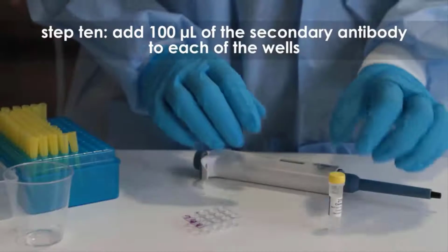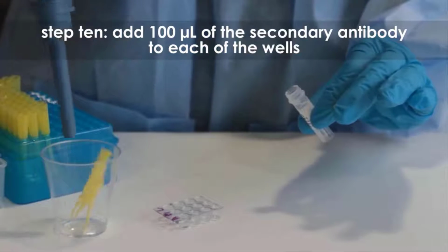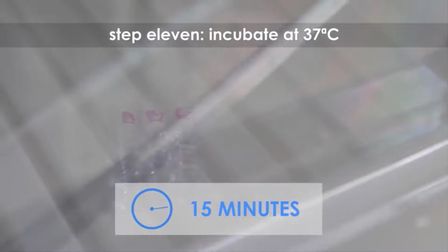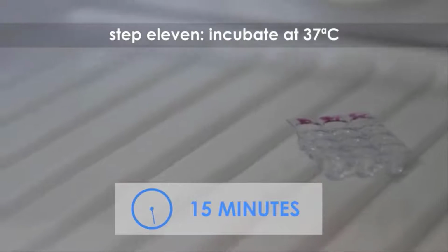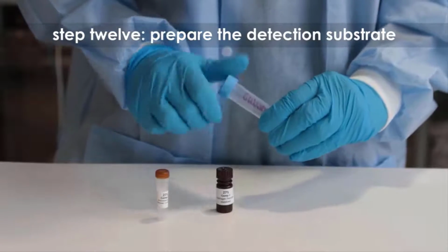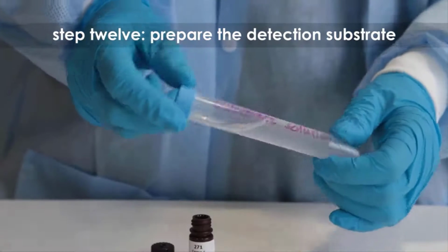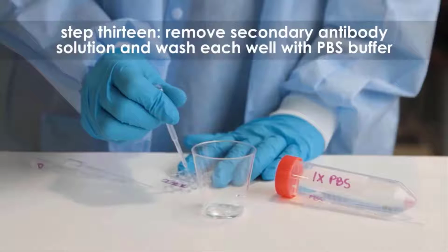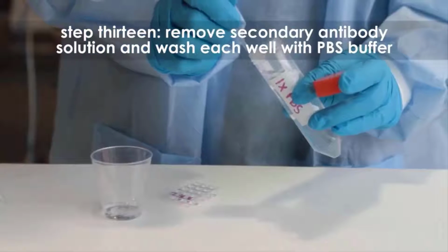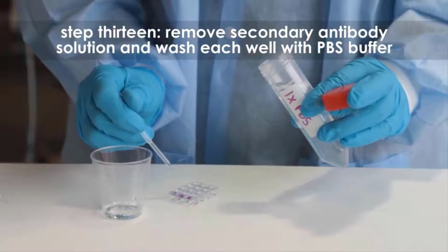Step 10. Add 100 microliters of the secondary antibody to each of the wells. Step 11. Incubate for 15 minutes at 37 degrees Celsius. Step 12. While the samples are incubating, prepare the detection substrate as specified in the product literature. Step 13. Remove the secondary antibody solution from the wells using the transfer pipette designated for each sample. Wash each well once with fresh PBS buffer.